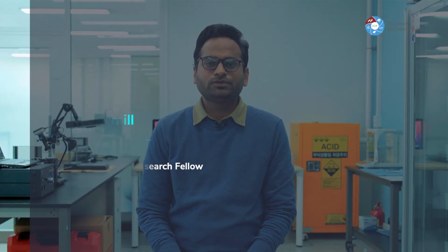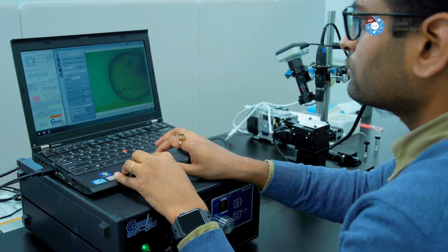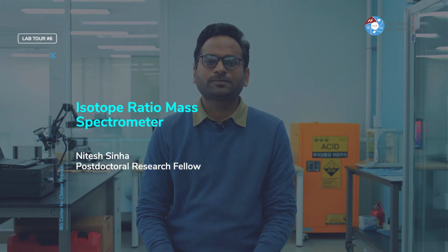So we typically use a Dremel hand drill device to obtain samples for uranium dating, and for high precision stable isotope and clumped isotope analysis, we use our new Micromill, which can drill samples every 100 micrometers or even less. Now let me introduce you to the main equipment in our lab, our isotope ratio mass spectrometer.